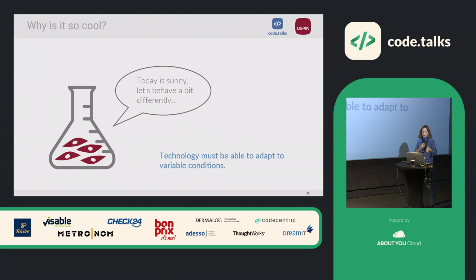While if I put something in my programming so that I can react to what happens, well, I can use Google Maps, say, okay, yeah, there is traffic on this road, let's take the other one. This is a bit the same thing: being able to react and put some intelligence in the system so that the experiment can react to the external conditions. That's it.